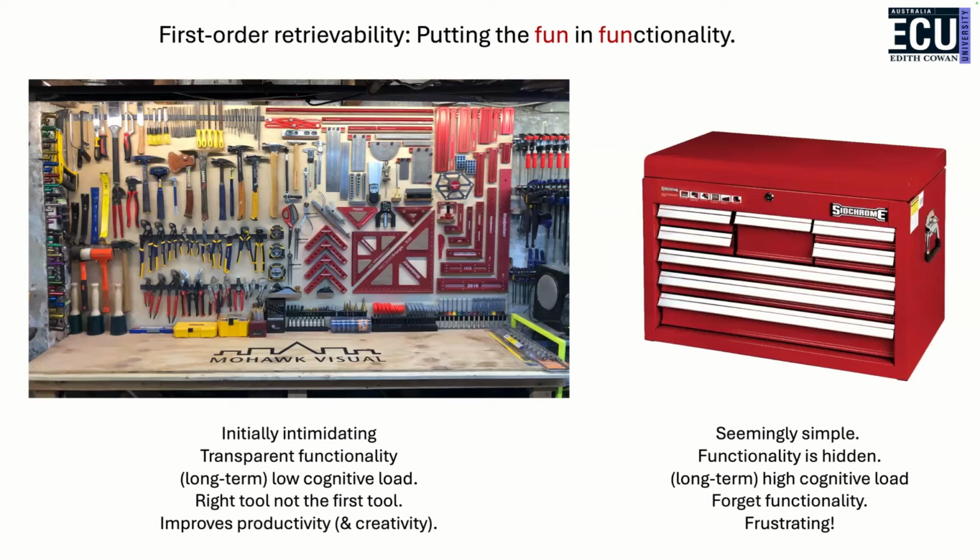But the thing that I really find interesting about this, and the idea of moving it over to software, is although it might be initially intimidating that you've got all this choice and all these possibilities, and that might scare you a bit, once you really start using it, that cognitive load really does reduce very, very quickly. And the great thing as well is once you've used it a bit, if you go away for 2 months and then come back, you're not wondering where you've kept tools or where you are in your workflow, because it's all there in front of you, first order.